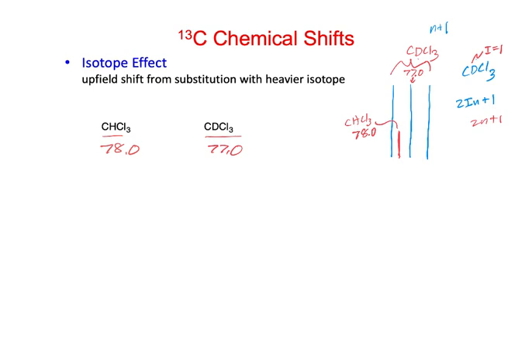So I know I talked before about some situation, maybe where you have an alcohol and an ether, and you're interested in assigning the peaks for these 2 carbons. But the chemical shifts are reasonably similar for next to an ether or an alcohol. And we did talk about one way to distinguish those. Do you remember that? It was more of a derivatization.